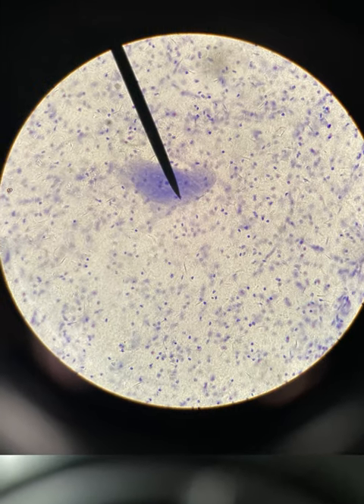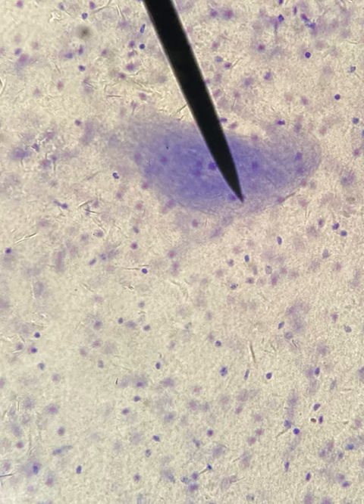Now, this is a nerve tissue slide. And this right here is actually a neuron. And these little cells are glial cells. And so if you look, these nerve cells, which don't exactly look like textbook drawings, they function to send electrical impulses throughout the body, right? And they're found in the brain and the spinal cord and the nerves, obviously. And these little glial cells, they support your neurons. They support and nourish your neurons.